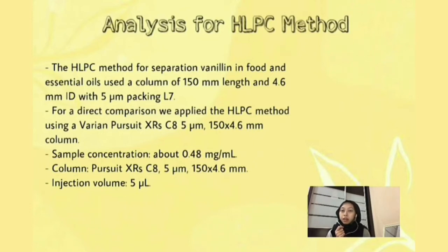The sample concentration is about 0.48 milligram per milliliter, and the column is Pursuit XRS C8 5 micrometer, 150 times 4.6 millimeter, and the injection volume is 5 microliter.